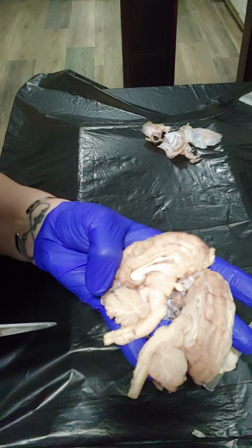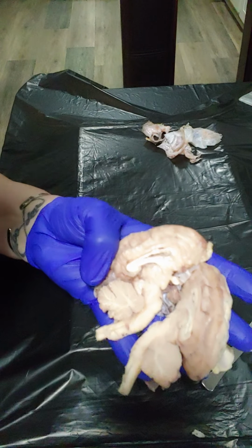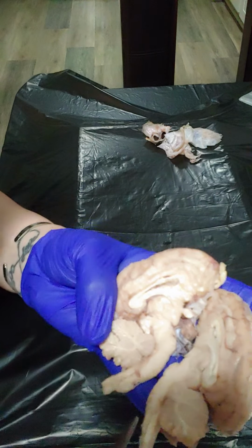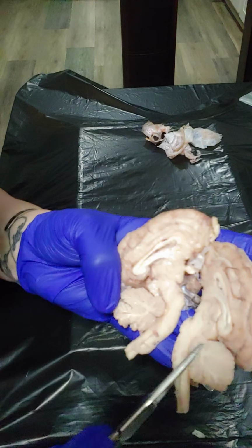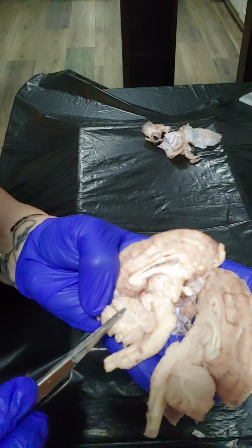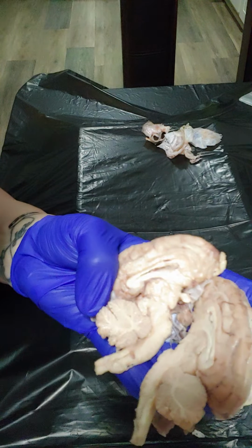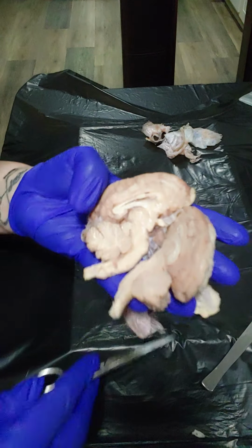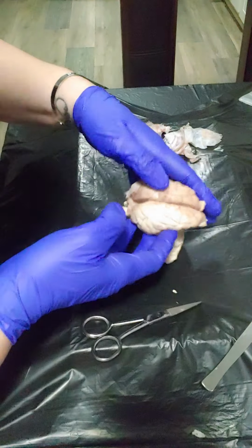And then lastly is going to be the tree of life, or the arbor vitae. I'm going to go with tree of life because I can say that. And that's where I was showing you the white matter and gray matter. Kind of looks like a little tree. There's little branches and everything streaming off from it. So that is my very ugly sheep brain.